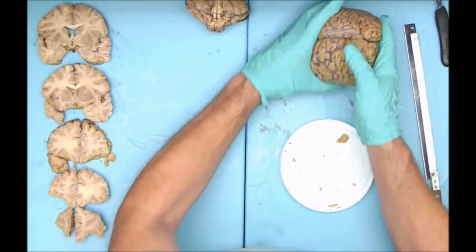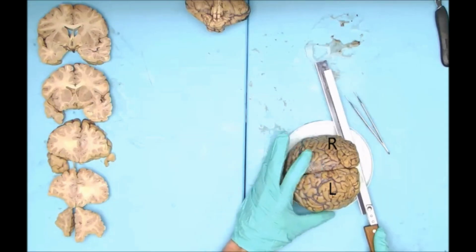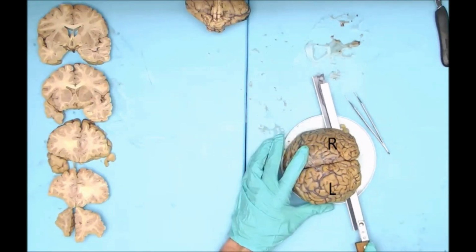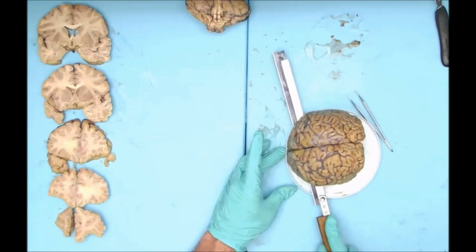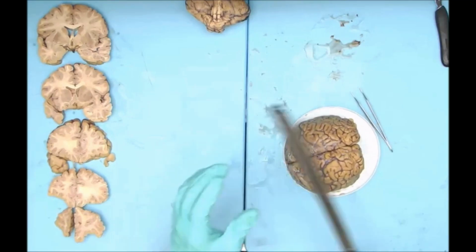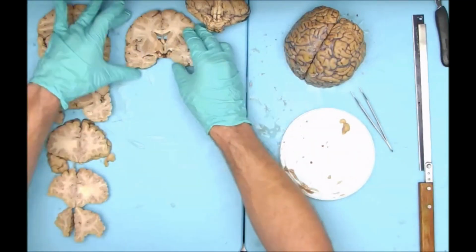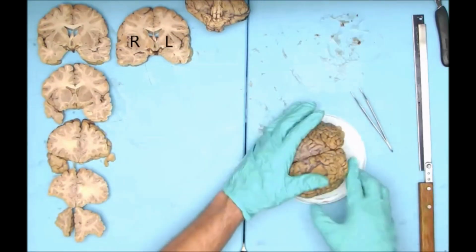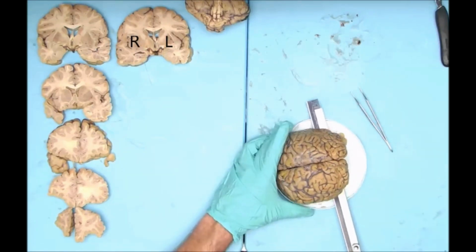So now we're going to move on to the posterior half, and you'll notice the laterality once again. Okay. And as far as sectioning goes, I am doing a little bit of a sawing motion, but if you can do the least amount of sawing with the blade here, you'll have less artifact on the cut sections.